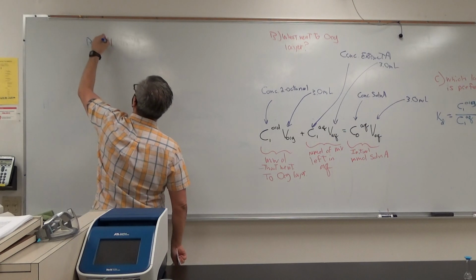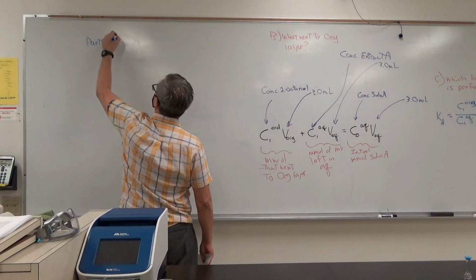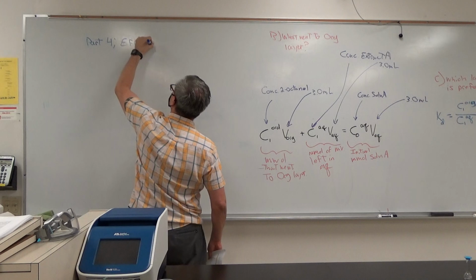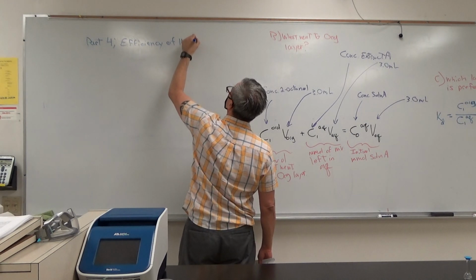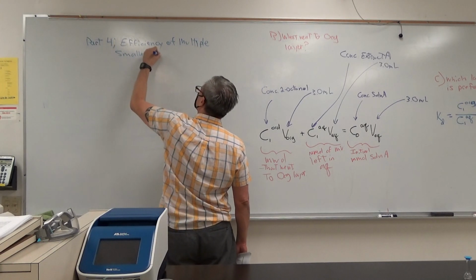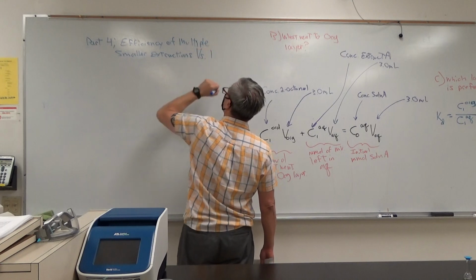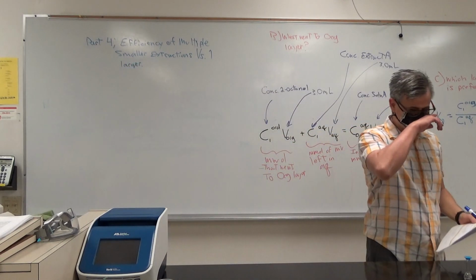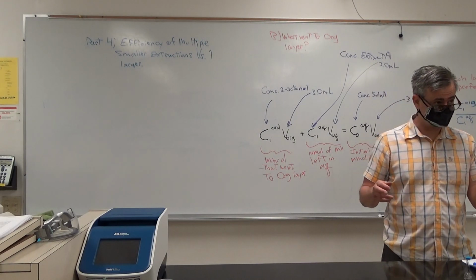Part 4. In part 4, what we're going to do is compare the efficiency of multiple smaller extractions versus one larger extraction. We're going to see what's more efficient: to do multiple extractions, or to do one large one.